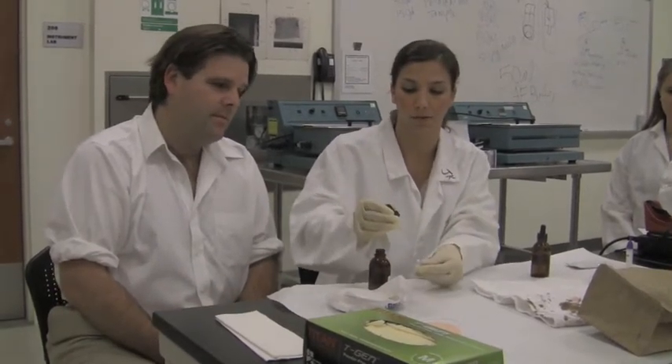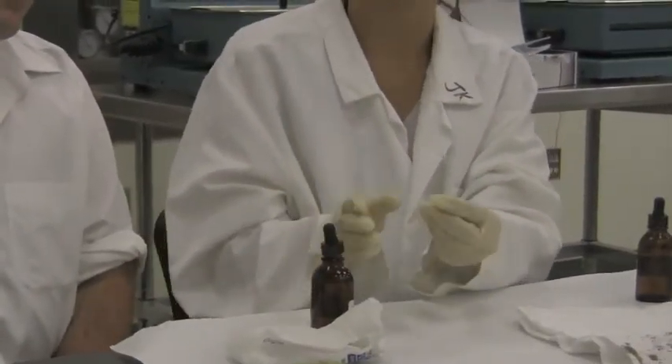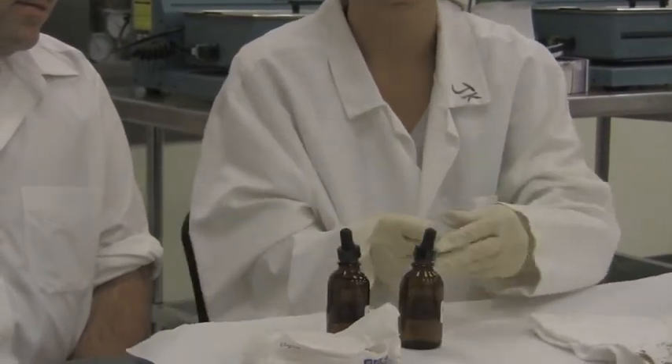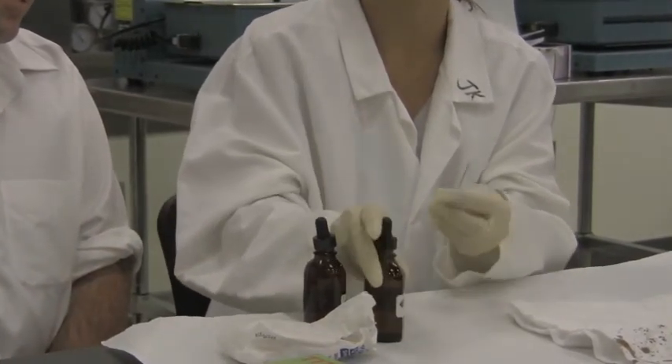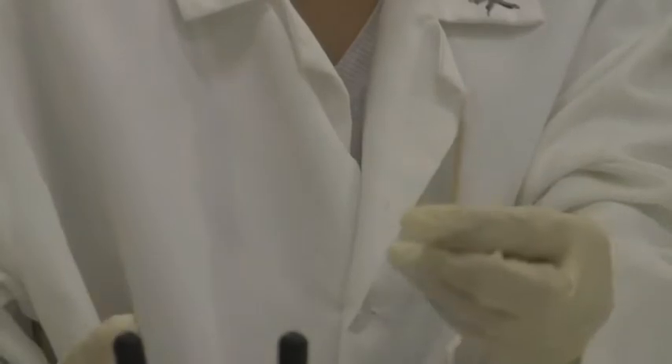A negative control would be to not swab anything and then add our chemicals. First, we add the phenolphthalein, which is where the name of the test comes from — it's a color reagent. I'll add two drops. We see nothing at this point, which is how it should be. Next, we add 3% hydrogen peroxide. And it is a negative result — there is no color change. Because this is a negative control, we expect a negative result. So far, we know that our swabs are not contaminated.